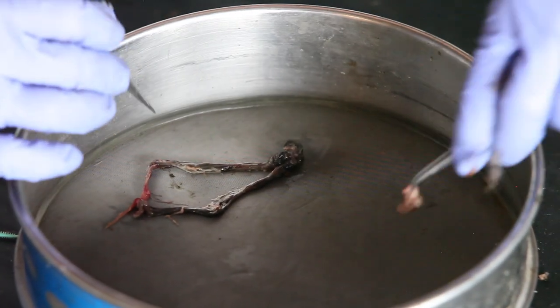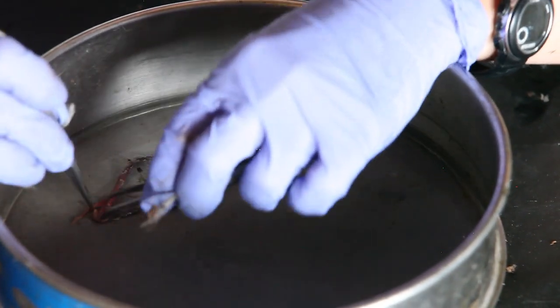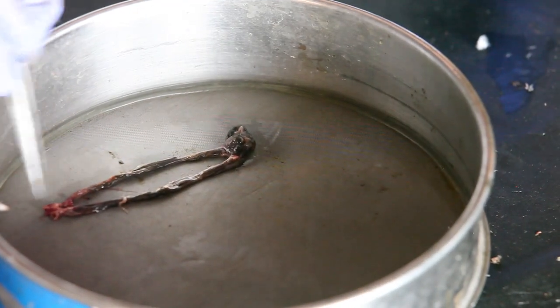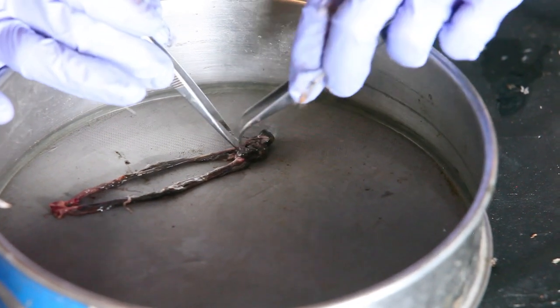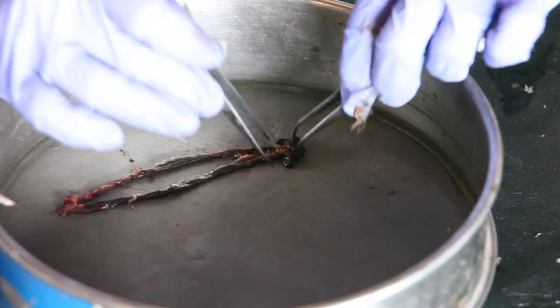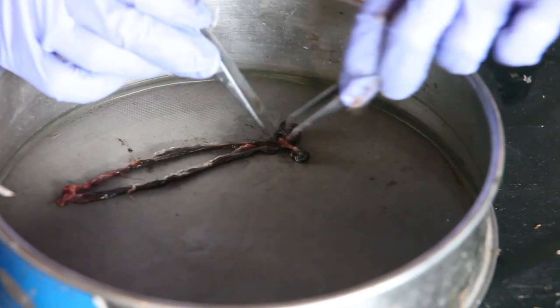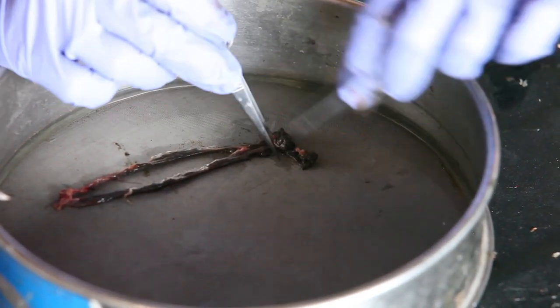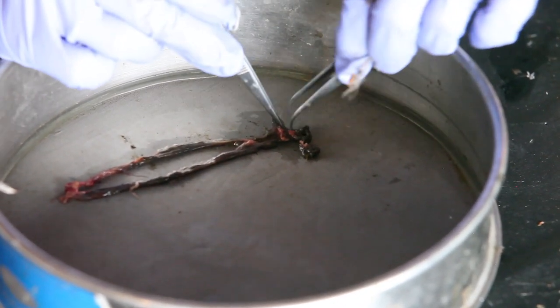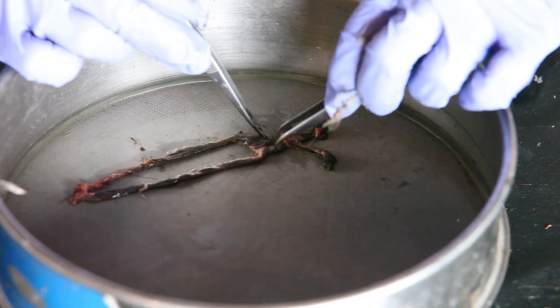So once we've got the small intestine out, we can put that aside. We don't need that. And then the majority of the worms are going to be up at the top over here where the three branches joined, and then down here in the coils. And so those being the terminal pouches, what you're calling the coils, they're coiled up on the distal end of the ceca. Right. And so I'll typically go and find the connective tissue and just uncoil it as best I can so that I can have it out flat.